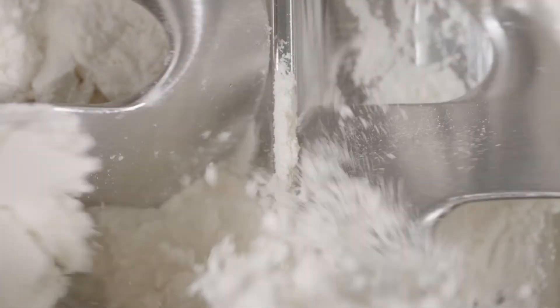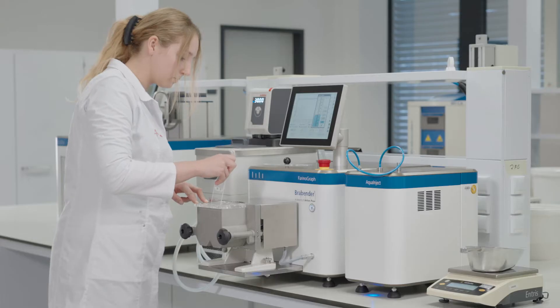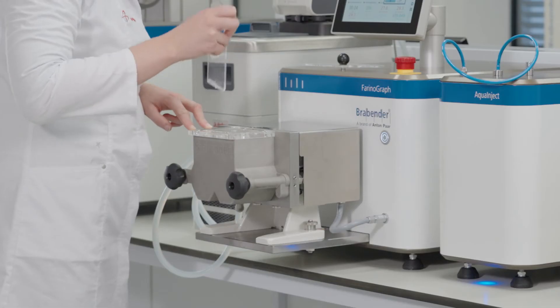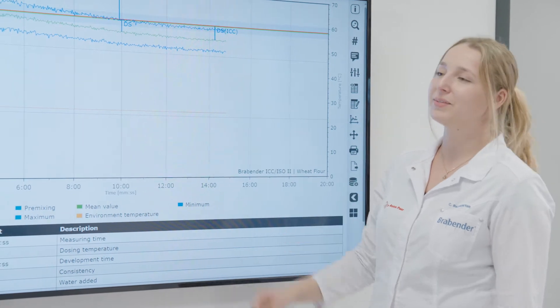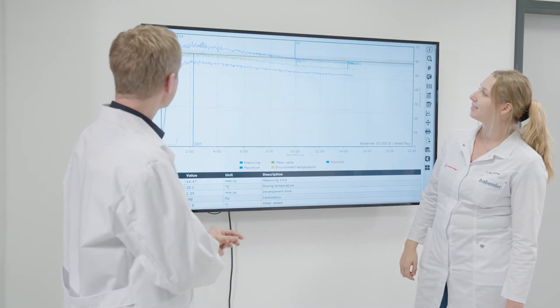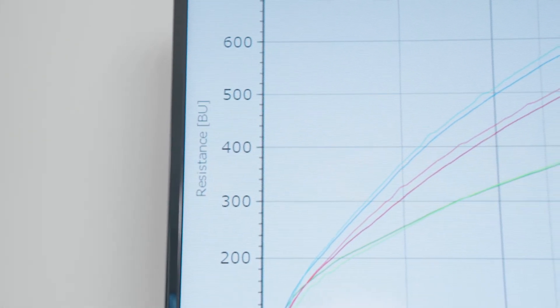Assurance on every single grain, on every gram of flour, leading to utmost dough quality along the entire value chain. And yes, it speaks the language of experts worldwide. The Brabender Farinograph units: established, trusted, unmatched.